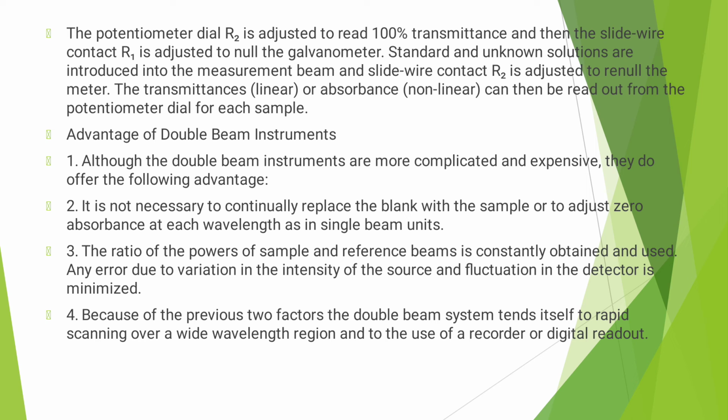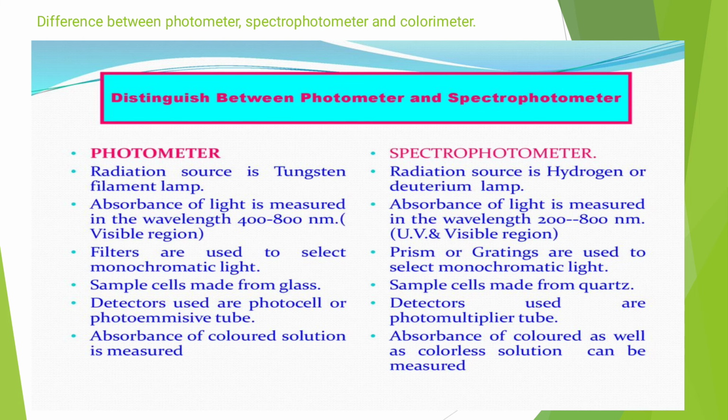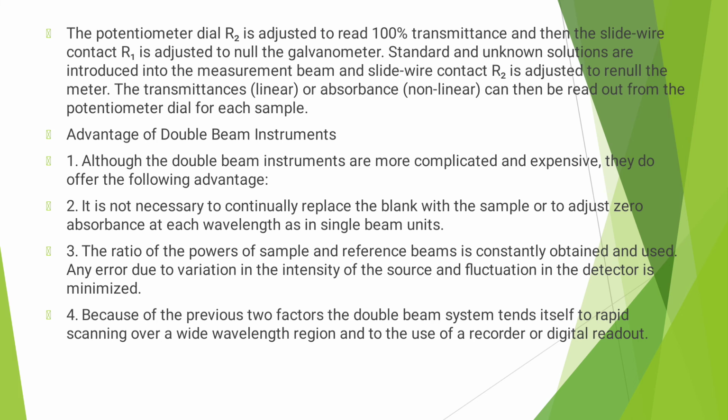By keeping different concentration solutions, we can measure the intensity of the transmitted light. Here we pass the beam through the reference as well as the sample solution. So the beam passes twice, through the solution in the reference as well as in the sample.